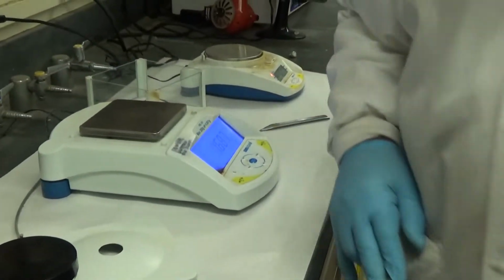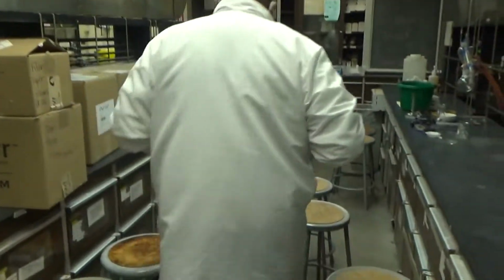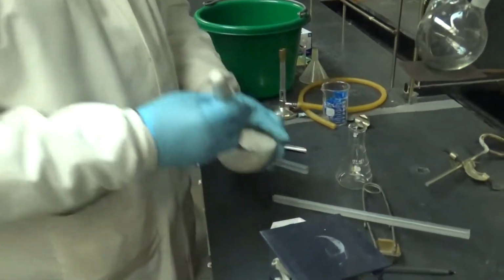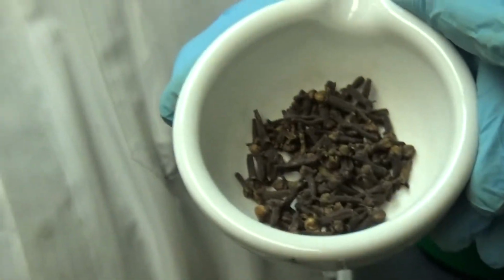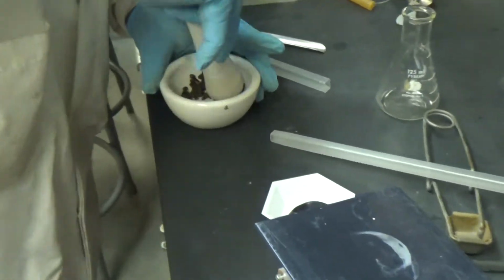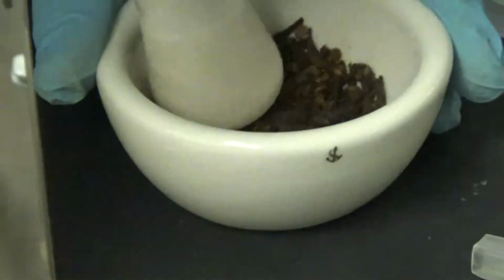Back to 0. Okay. So now a mortar and pestle to grind that. You're putting the cloves in a mortar and using the pestle to smush it up, to grind it. Grind that up, kind of pulverize it into a semi-powdery mixture.